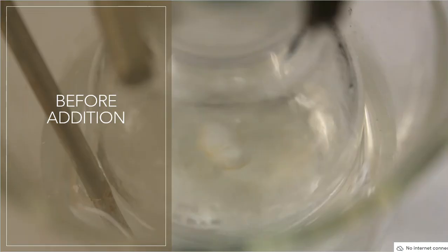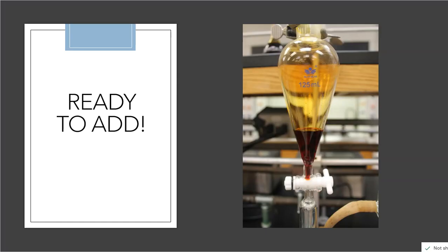All right, so this is what it looked like before the addition of any bromine at all. That way you can make your observations in your notebook if you need to, but that is what that boiling flask looks like. So I'm ready to add. I'm ready to add my bromine solution into that flask. So I'm going to take the stopcock and I'm going to open it up, and I'm going to quickly drop in a certain number of drops, and I've counted them.